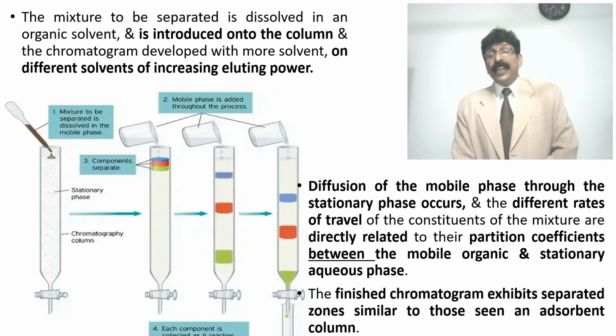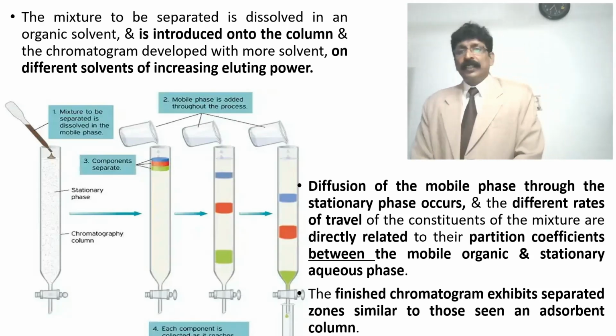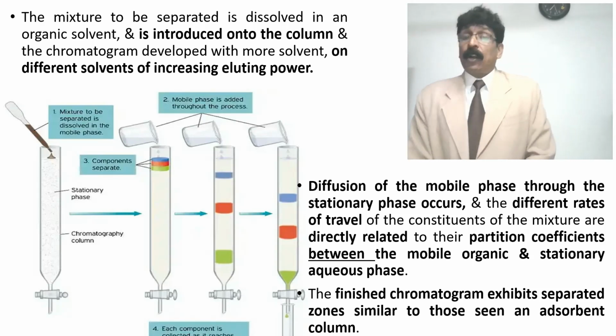The finished chromatogram exhibits separate zones similar to those seen in an adsorbent column.